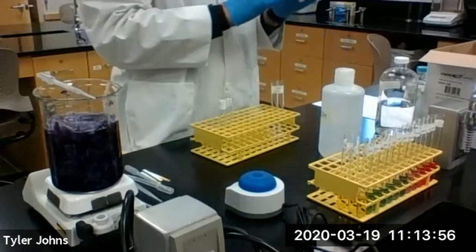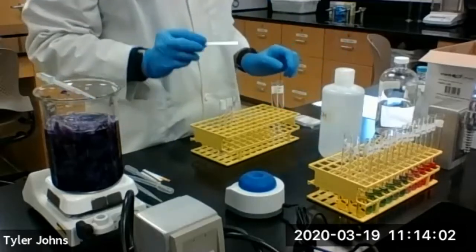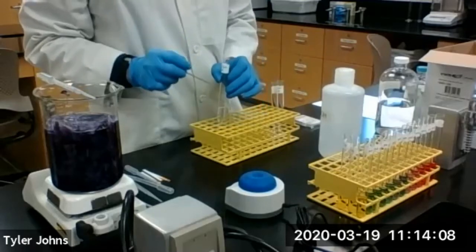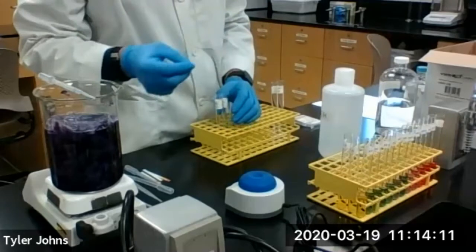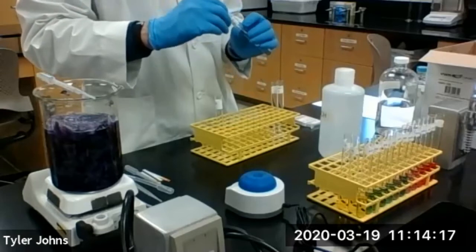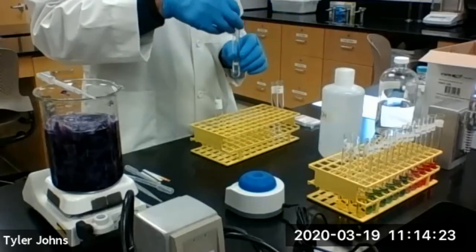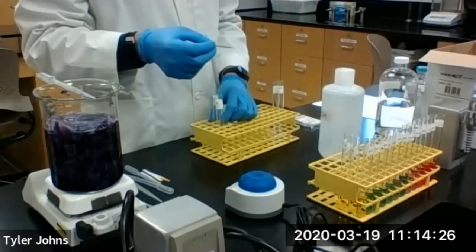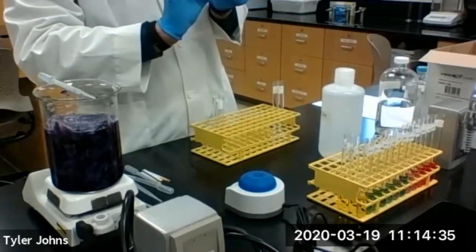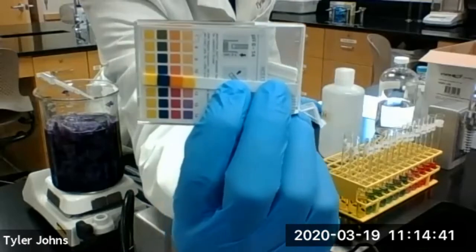And we will check the pH of these solutions with the addition of sodium hydroxide. Now recall that we already checked the pH of just the deionized water by itself and just the pH 7 buffer by itself before we did the addition of the hydrochloric acid in the other test tubes. Okay, so here's the pH of the deionized water plus 5 drops of 0.1 molar sodium hydroxide.